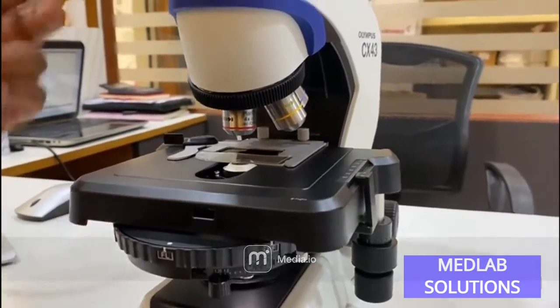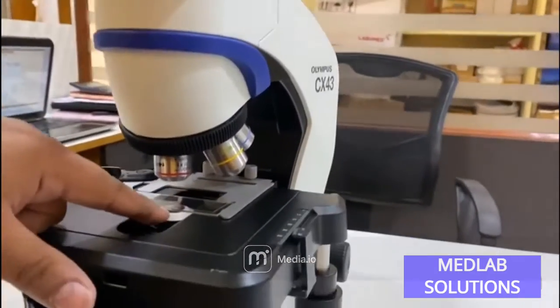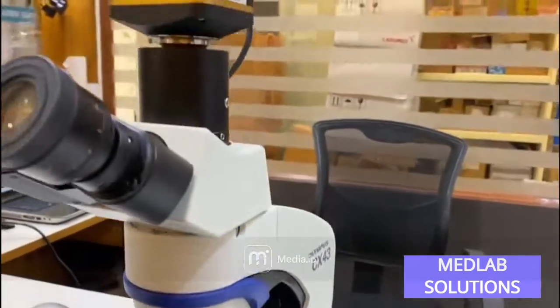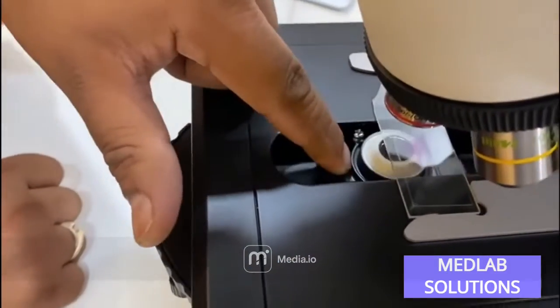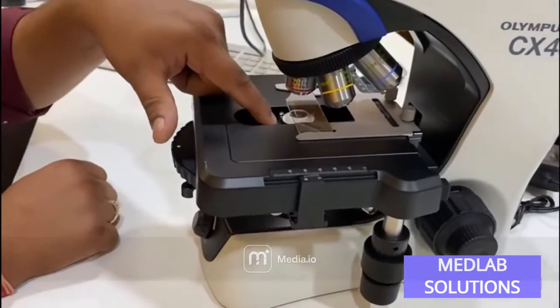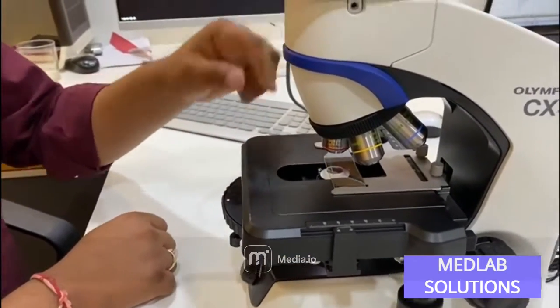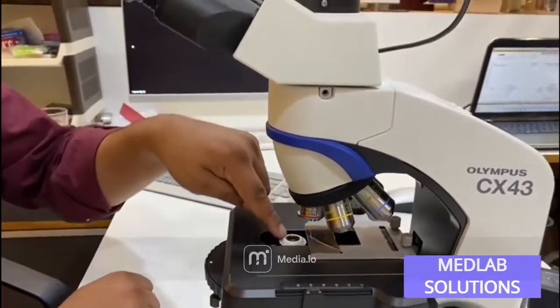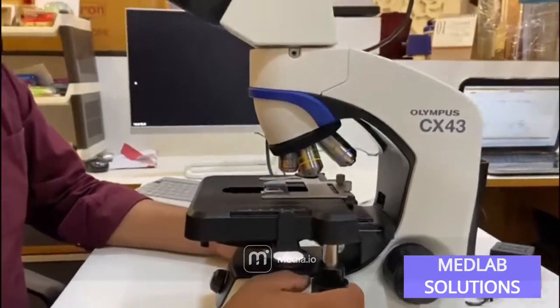When using fluorescence illumination, the light comes from the top and can get reflected off the condenser lens when looking through the eyepiece. To avoid this, you move the condenser backwards. For bright field you position the condenser onto the objective, but for fluorescence you move it back so the light is not reflected onto the condenser lens.